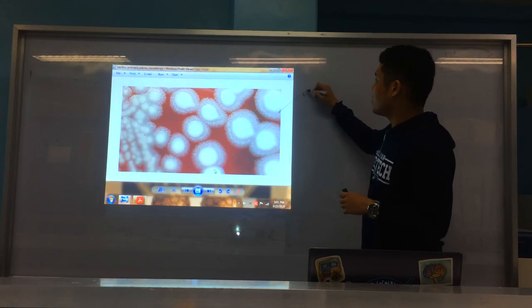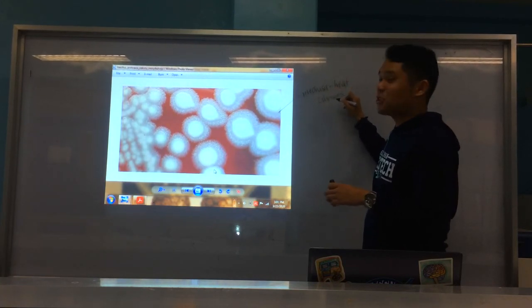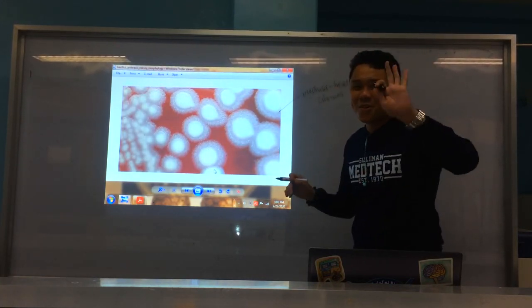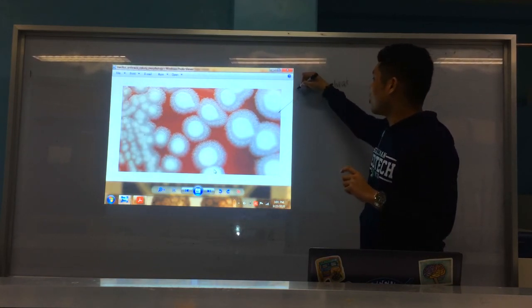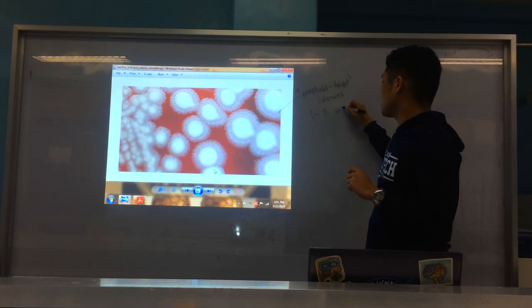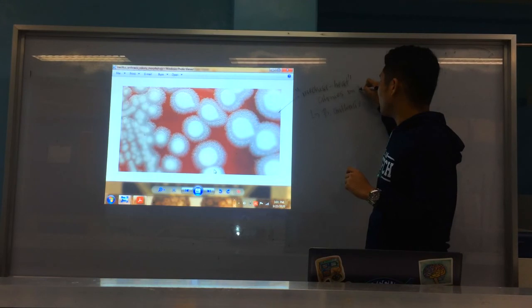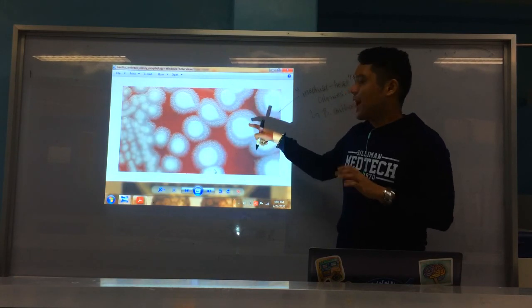what we describe as Medusa head, di ba? If you're familiar with your Greek mythology, Medusa head colonies, yes, mga ano dyan, mga demigods, Percy Jackson, hello, kaway-kaway, joke, okay, exciting. Okay, anyway, Medusa head colonies, this is characteristic of Bacillus anthracis. Okay, alright. Medusa head colonies on BAP, diay, on BAP. Okay? Alright. Bacillus anthracis.